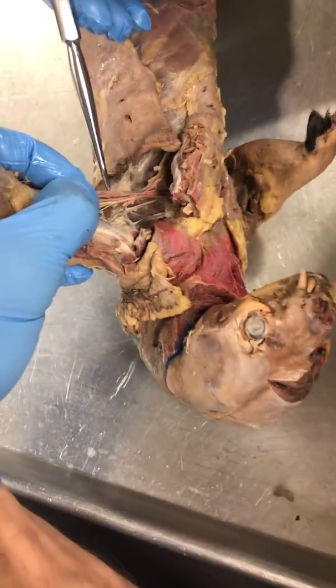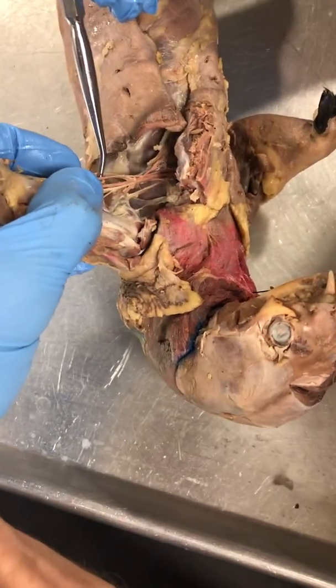So there's, like, all... Some of these are blood vessels.